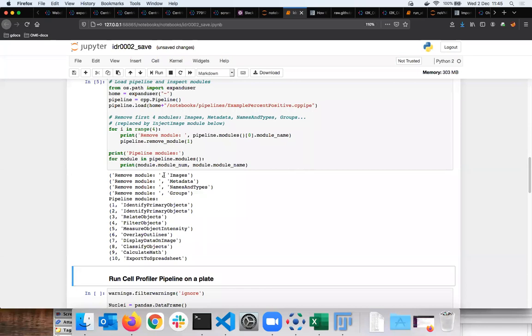Let me open the notebook. You can then inject the data as you go. It's Peter's screen, it's fine, he went away, but I can't scroll down, so I'm a bit stuck here, where you can actually inject your data into the pipeline.